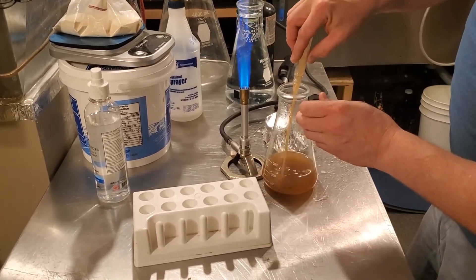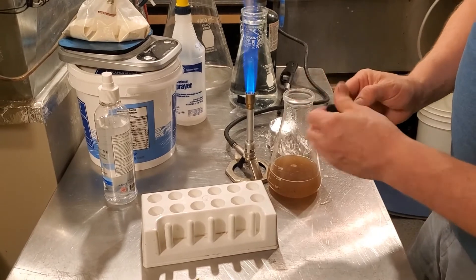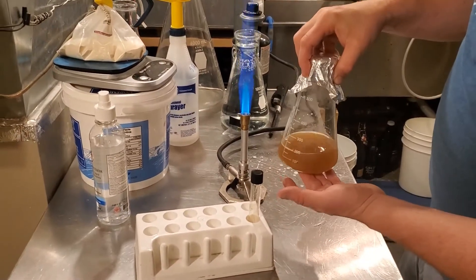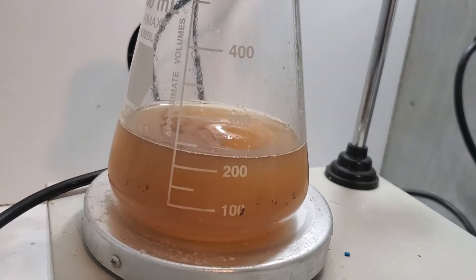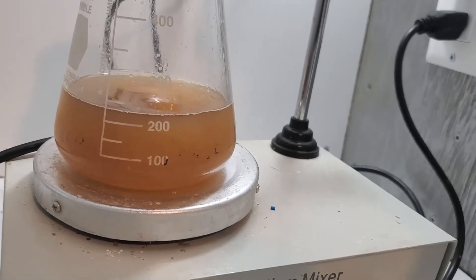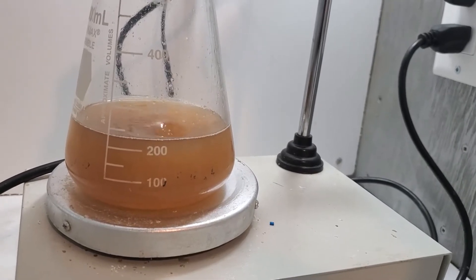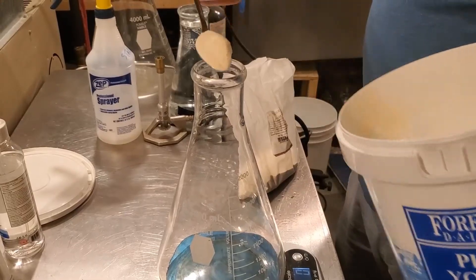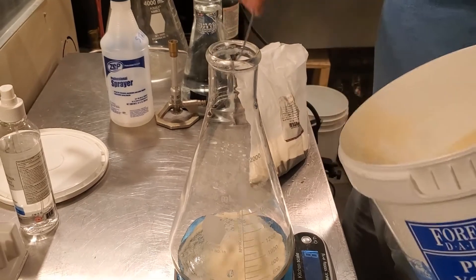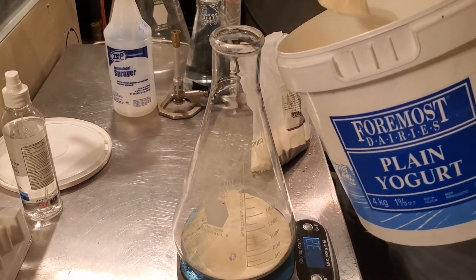I'll add this yeast into the next flask and cap it back up. This is going to go into the incubator — it's got a stir bar in there — so I'll get this set up on the stir plate. I can probably turn that down just a little bit; I don't need it going quite so aggressively. This is going to take approximately 12 hours until it's ready for the next step, so it's time to prep the next couple of flasks.